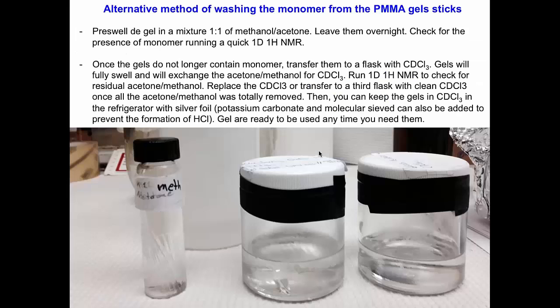Well, this is probably one of the best developments that we've made lately. You see, these are the PMMA gels. So you can, in a flask like this, put a methanol mixture 1:1 with acetone, and then you just leave the gels here.